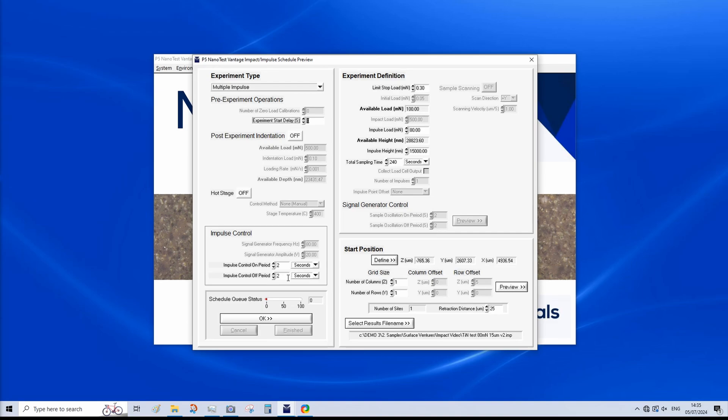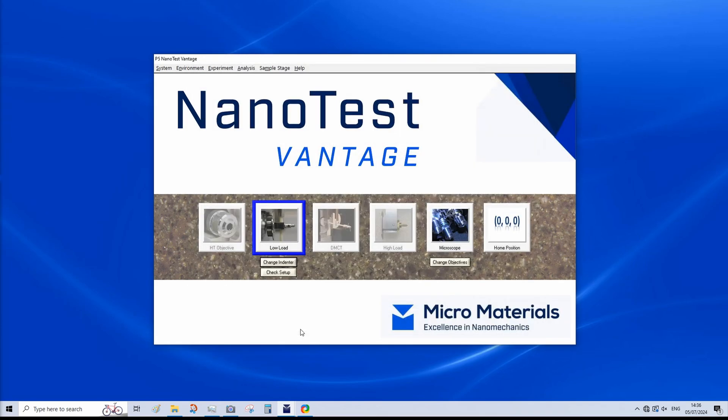We also need to input the total test time. This is typically on the order of one to 10 minutes. In this case, we have four minutes set. We can repeat the test any number of times by inputting the appropriate number of rows and columns. For this demonstration, we just have one impact test. And now we can click OK, finished. And now we've seen how a test is set up. And we will now allow the impact sequence to finish before we can review the data.